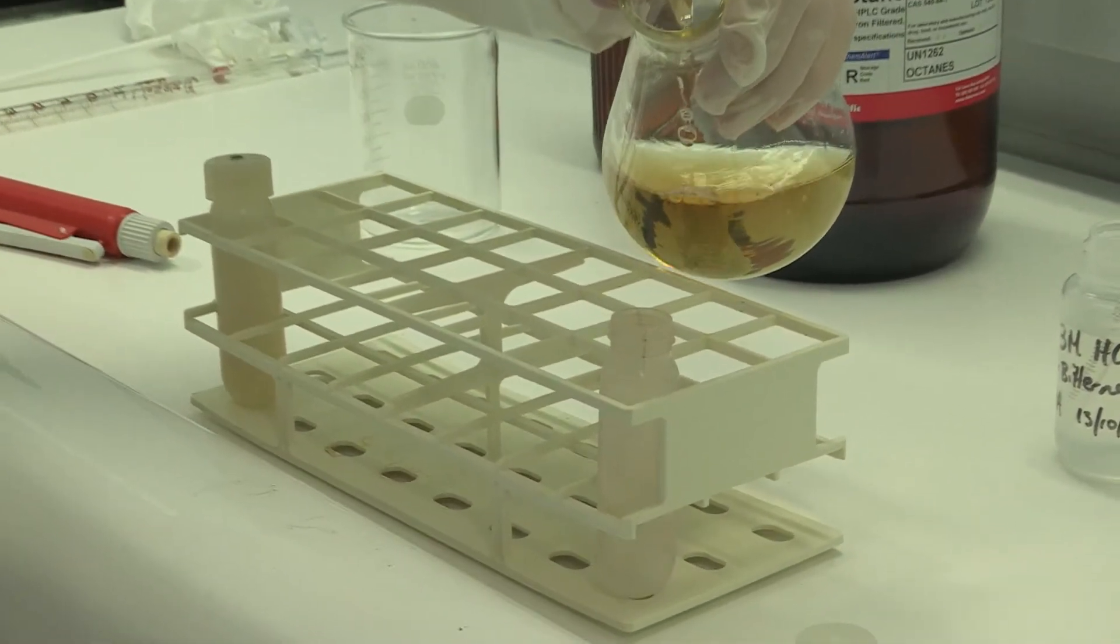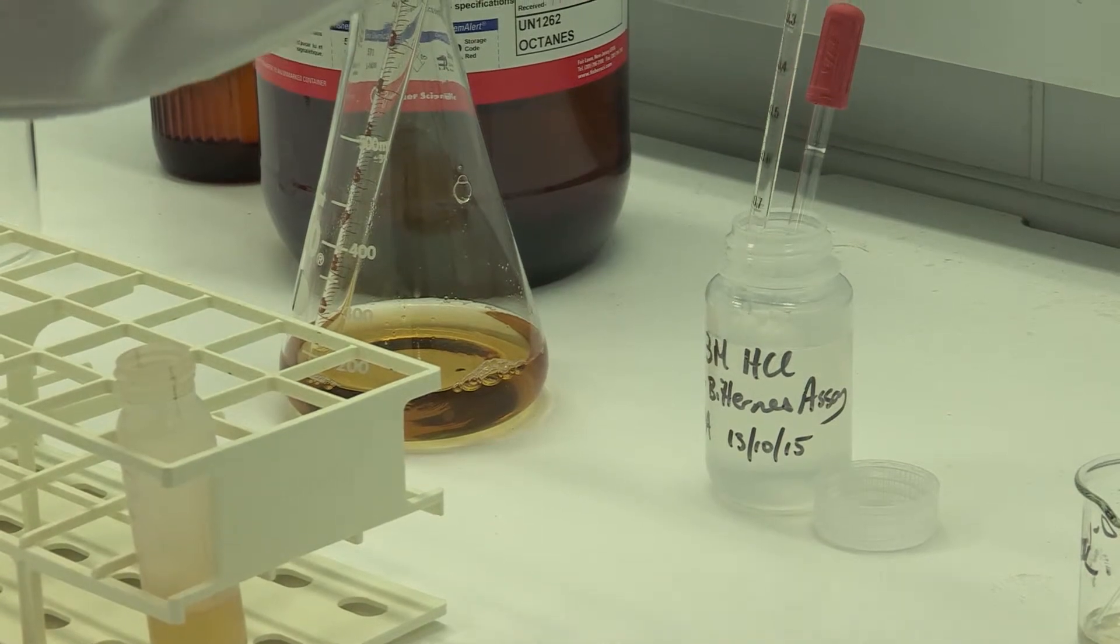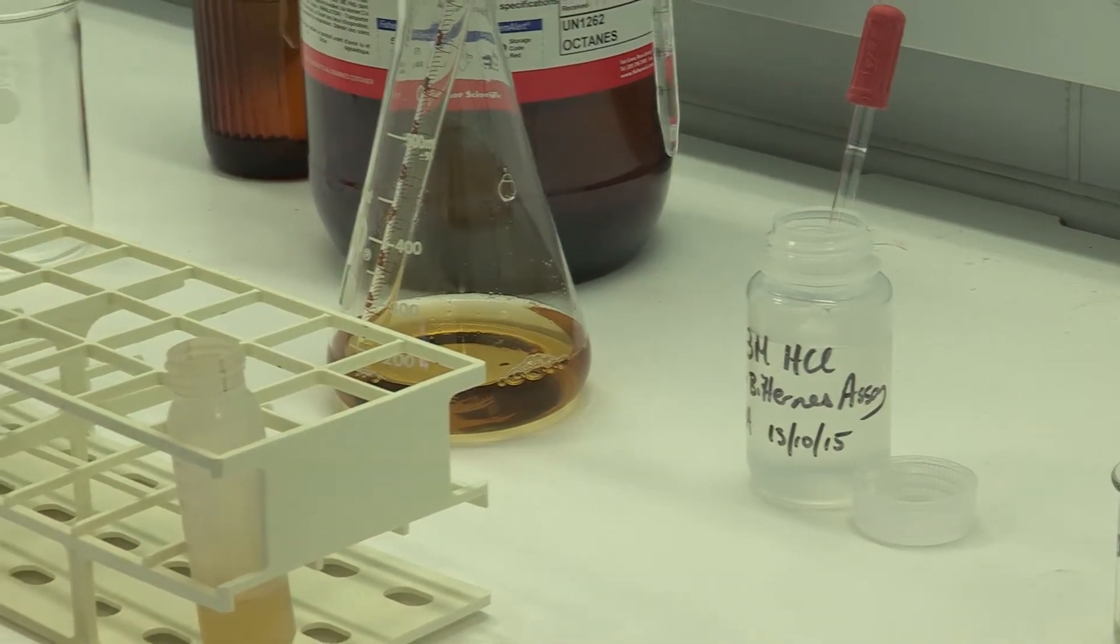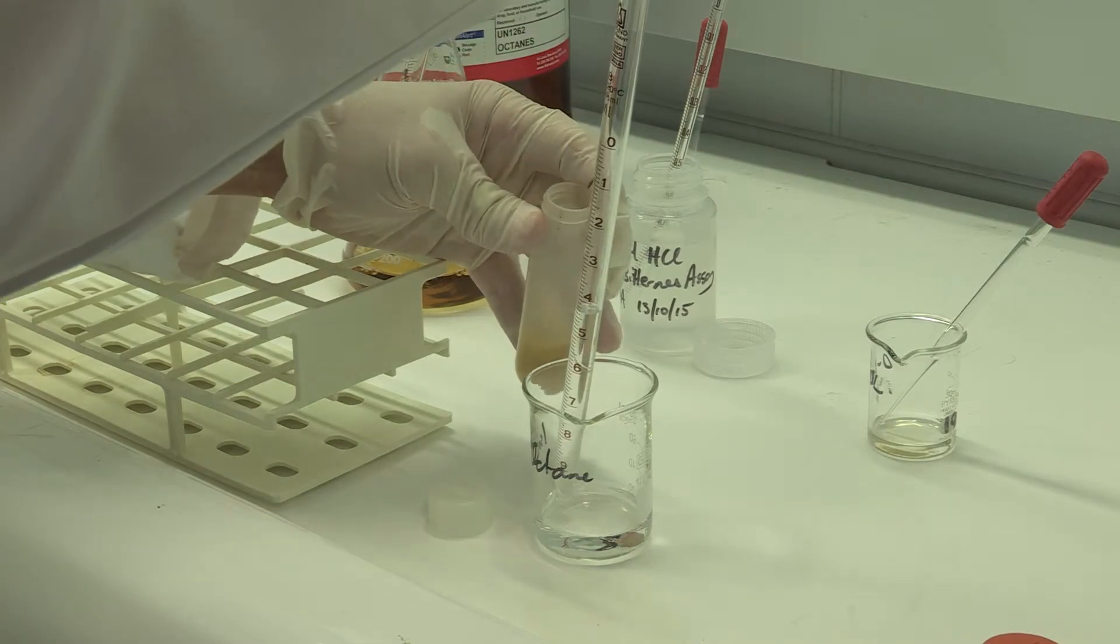For the analysis, a 10ml aliquot of beer is carefully added to a centrifuge tube. A small amount of HCl is added to acidify it, and some octanol may be added to reduce foaming.